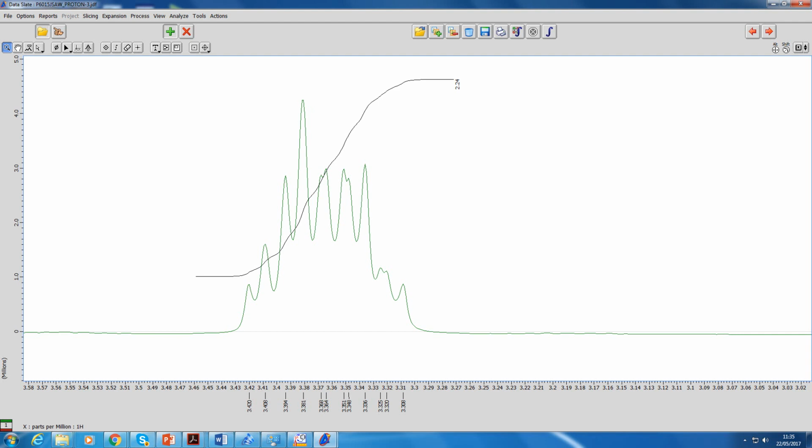You can shift it in Y as well. You can just move them both off. Here I'm just using the left mouse button without any Alt. I'm just left mouse moving it. And if you do that holding Shift down, Shift and move, now I'm only moving it in Y. It locks the ability to pan the spectrum. Probably less useful, that one.